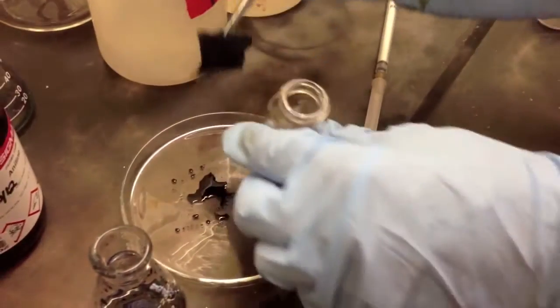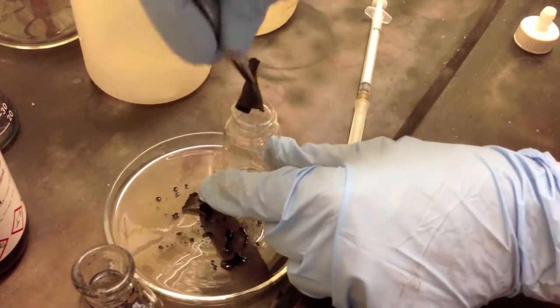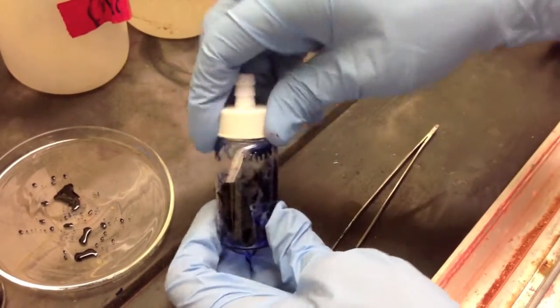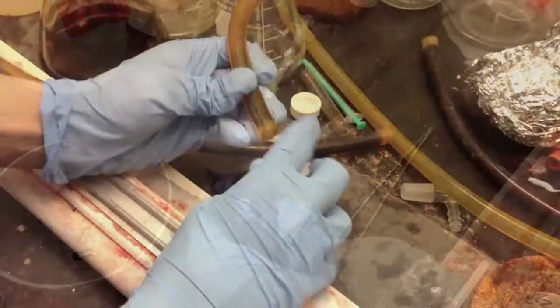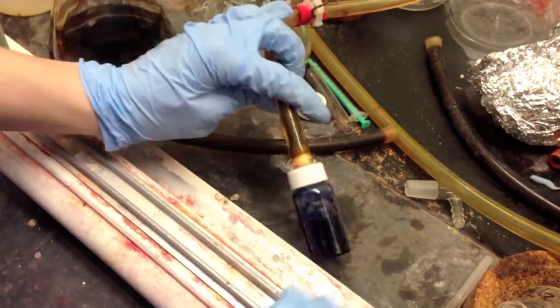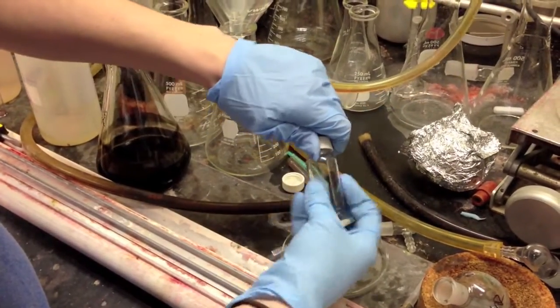We then placed this fabric square into a vial to dry under high vacuum, as NMP has a very high boiling point. After eight hours, we removed the fabric to see that it was dry.